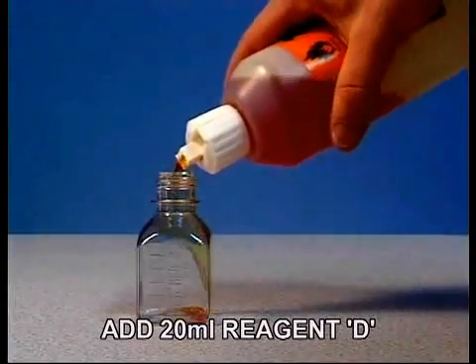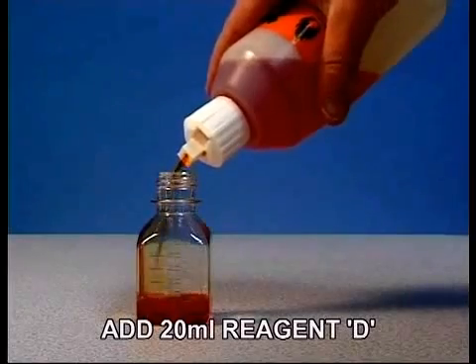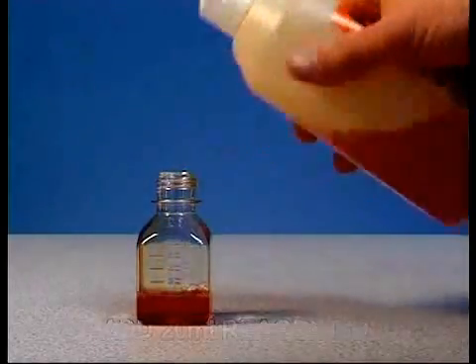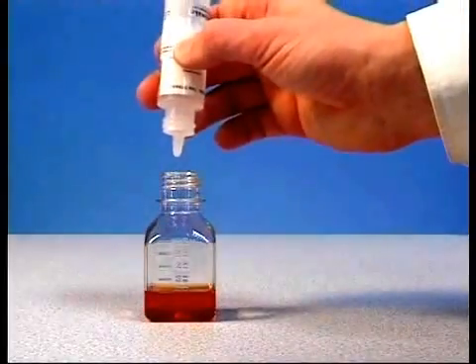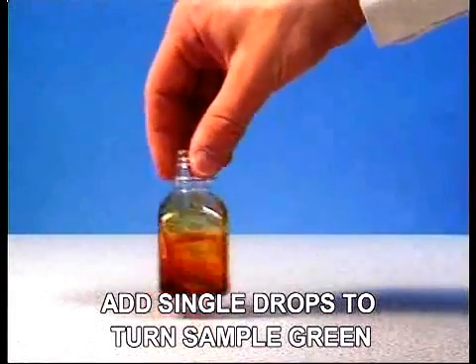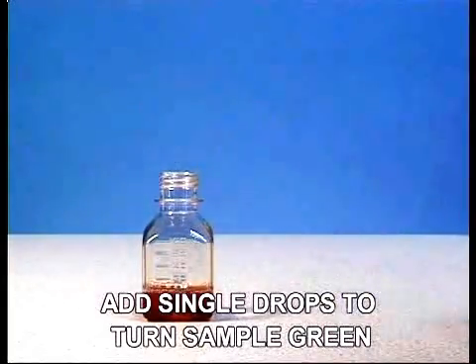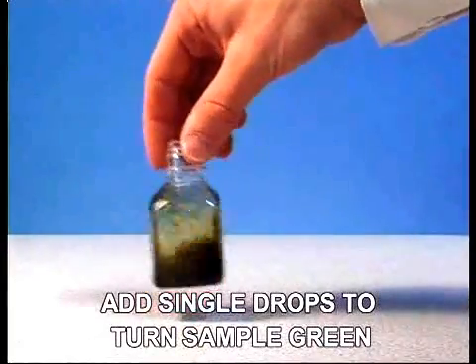With the pora cap in place, add approximately 20 millilitres of Reagent D into the test jar. If Reagent D is red in colour, add TAN titrant one drop at a time and shake until the colour turns to green.